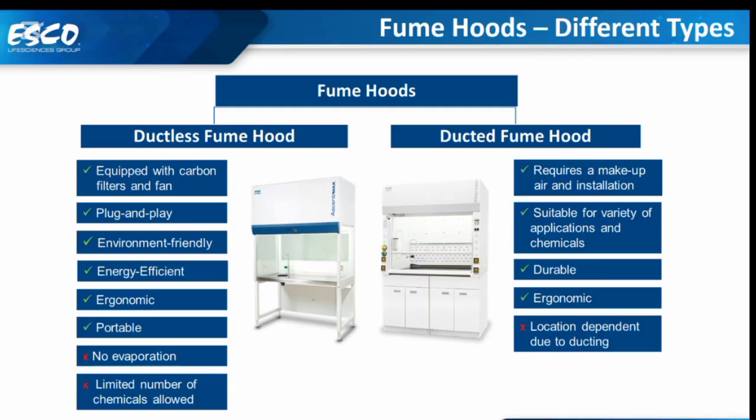So the ductless fume hood, as I've mentioned, is equipped with carbon filters and a fan. It is plug and play, environment friendly, energy efficient, ergonomic, and portable, as it comes with the stand and caster wheels. They are also benchtop, in case the user doesn't need the stand. It can be placed on the bench top. No evaporation, as the vapors are filtered, and a limited number of chemicals allowed. These are the limitations of the ductless fume hood.